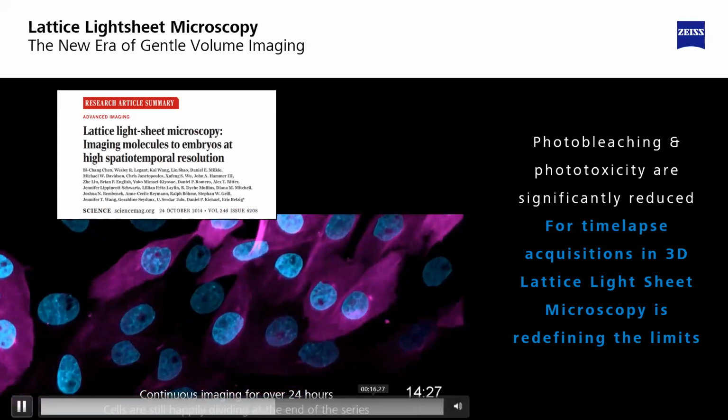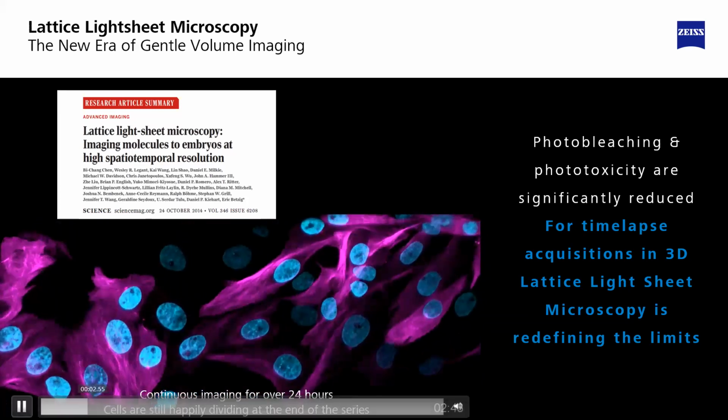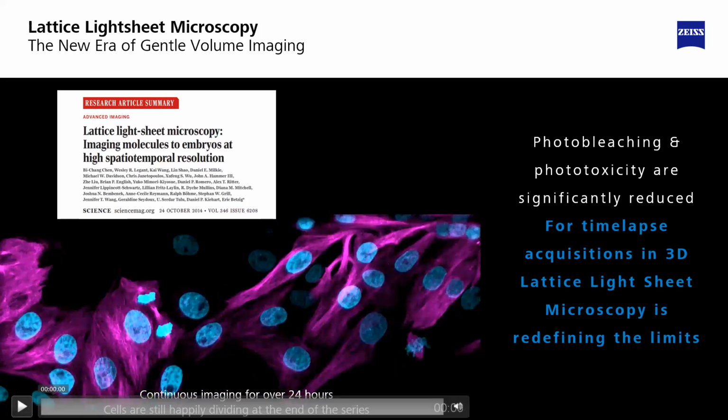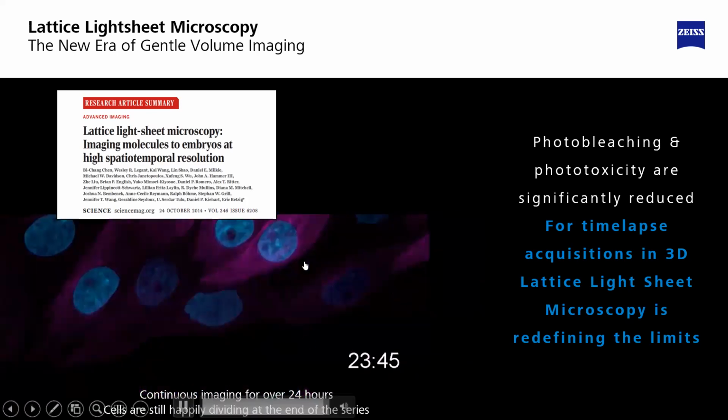When we reach the end of the movie, at the end of 24 hours, it's going to jump forward because I actually want to make it move forward. It's not going to cooperate. But at the end of the movie, what we can see is that there are still cells that are nice and happily dividing at the end of the time lapse here after 24 hours of continuous imaging.